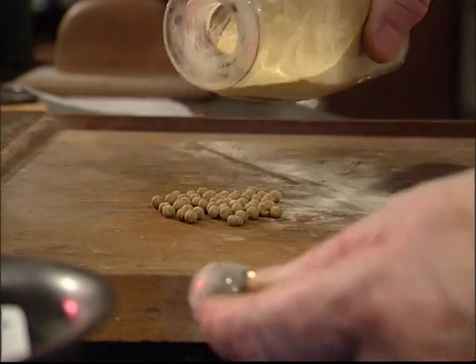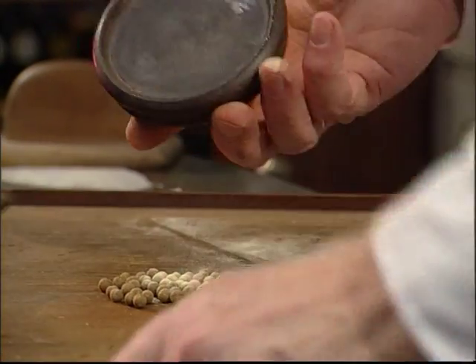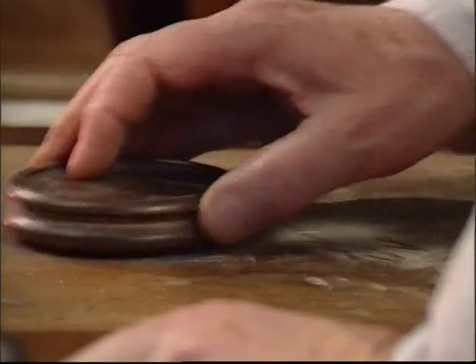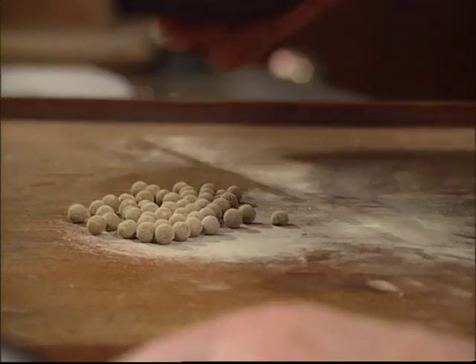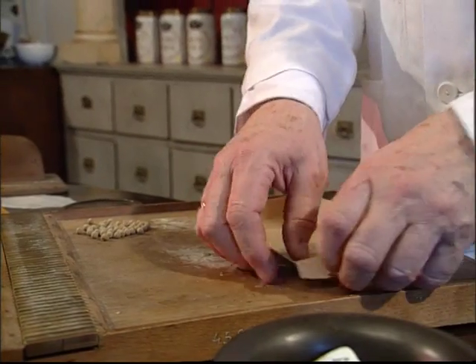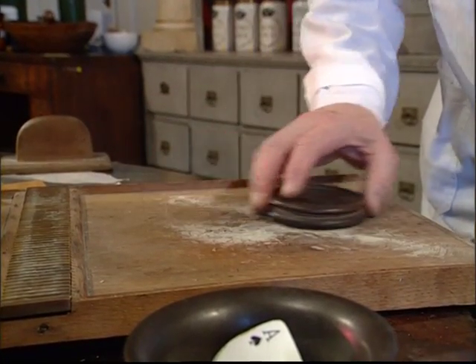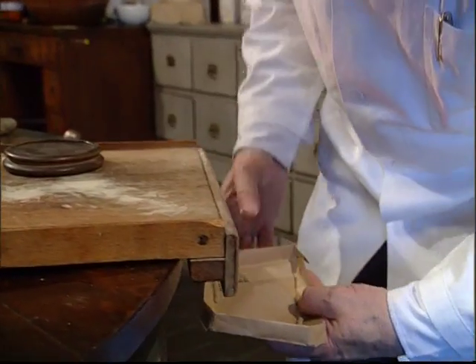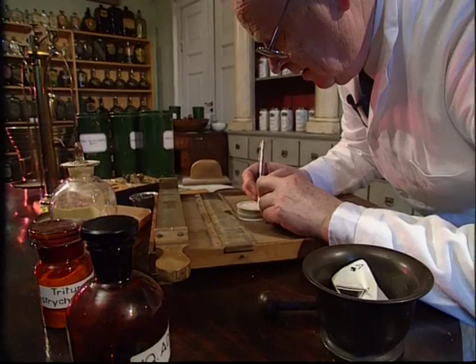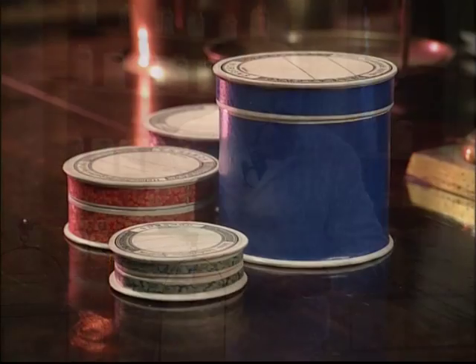And a little powder. And now we use a new tool called a pill finisher. And this gives them that final, perfectly round shape. So they're completely round. That's it. And now we have a solid little tray we can roll our pills onto. There. Now it's ready to be collected.